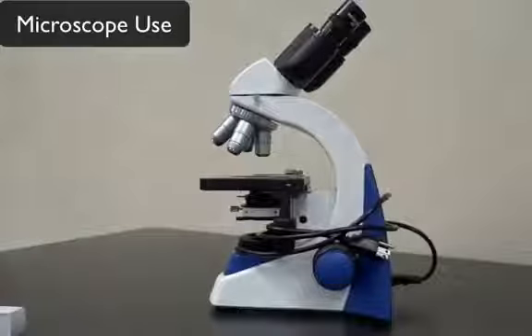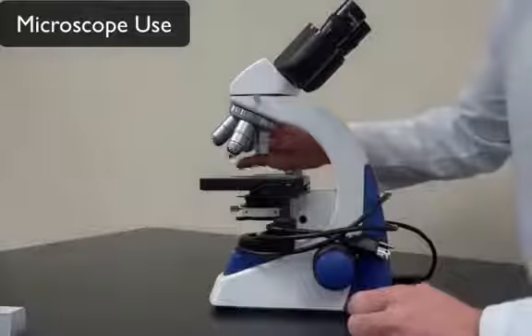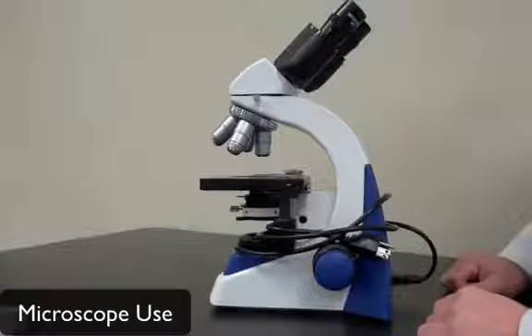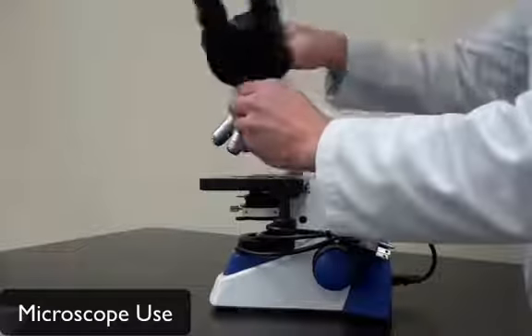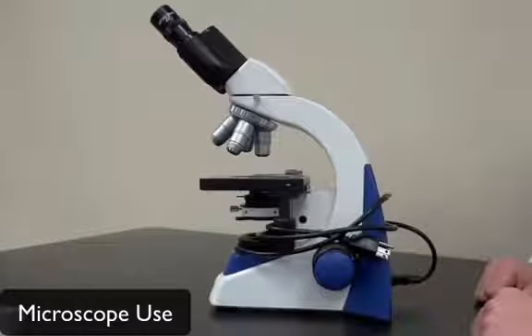Okay? One thing to note: when you take it off the shelf, what you should notice from the previous user is that the stage is in its lowest setting, and the scanning objective lens is in position. You can change this around if you want back to how it was, but just make sure it's locked into place and that you're careful with that.